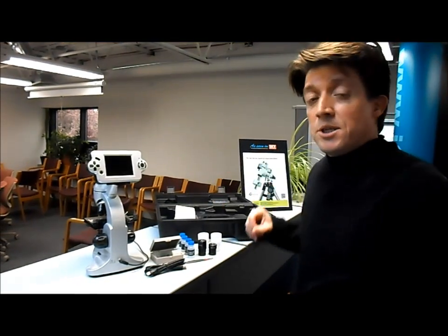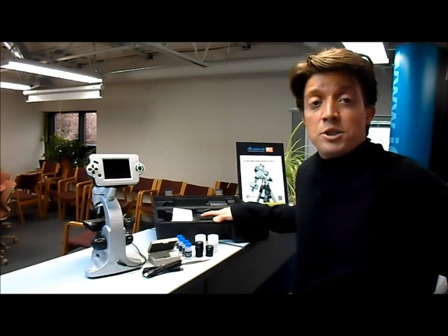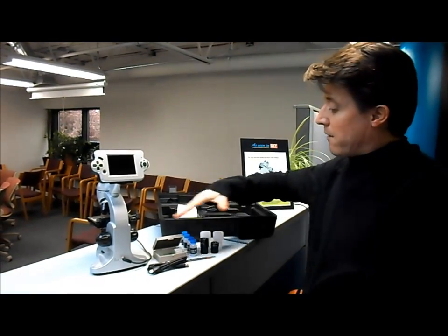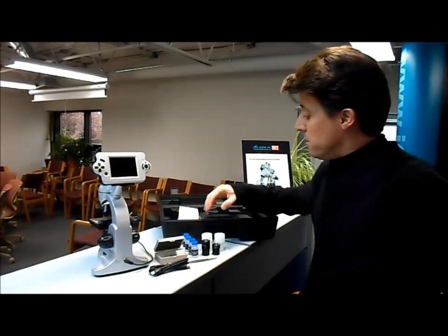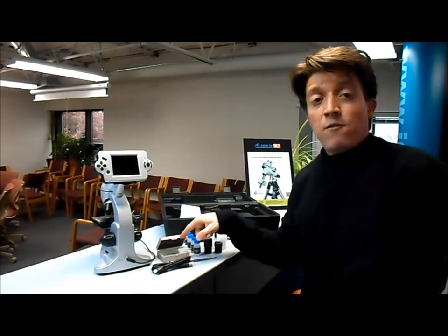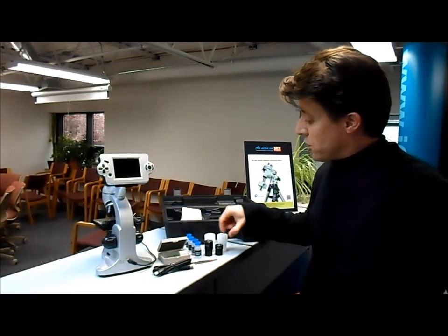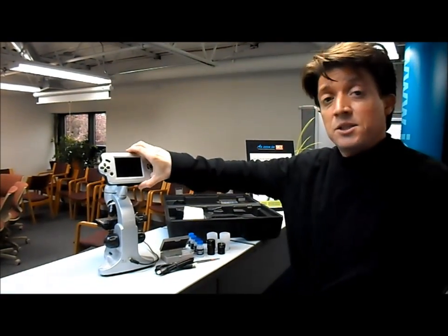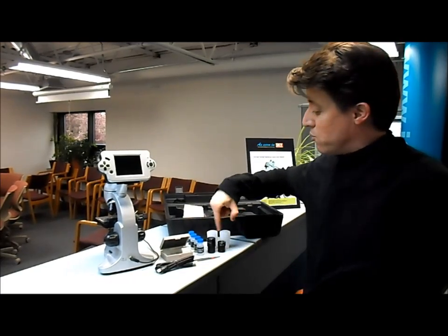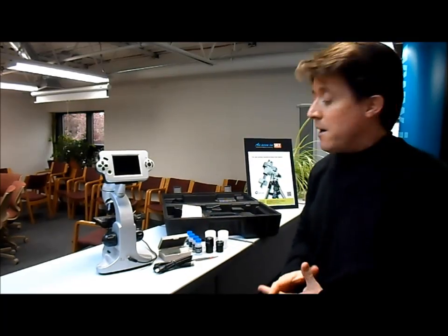It comes with everything you see here, has a handy storage case for storage and easy travel, comes with a lot of lab experiment equipment — liquids, crystals, tools — has five prepared slides and blank slides, and also has two traditional eyepieces, so you can actually take this LCD screen out and just use regular eyepieces. It has a 16x and a 10x eyepiece.